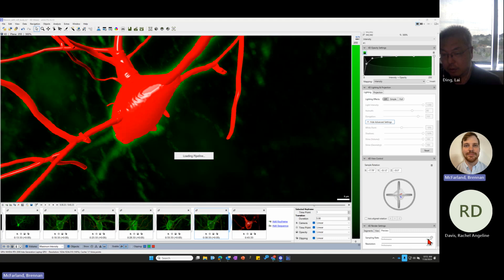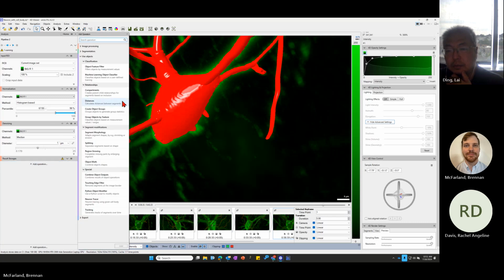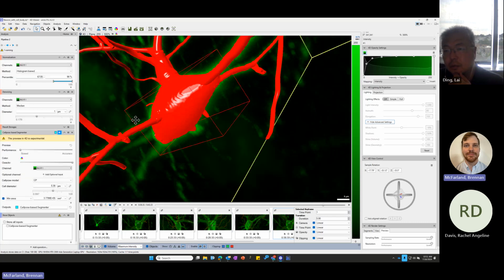But we can get close in how it looks by adjusting this up to quality. So when I do play this, it will put a little more emphasis on it looking nice rather than performance, where it's just going to run through and make sure it runs smoothly. Same idea with this eyeball function here, where we have performance or speed and accuracy, same idea as performance versus quality.